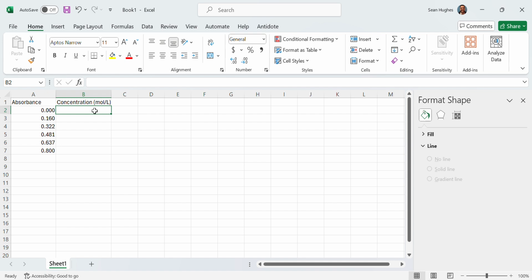Most of you wrote this down in scientific notation today, which I'm quite happy about. But to type things into scientific notation in Excel, it's a little bit more cumbersome. So 0 is 0 because you didn't have anything as water, didn't have any dye in it. But for the most dilute solution that you calculated, you probably calculated 1.60 times 10 to the minus 6.